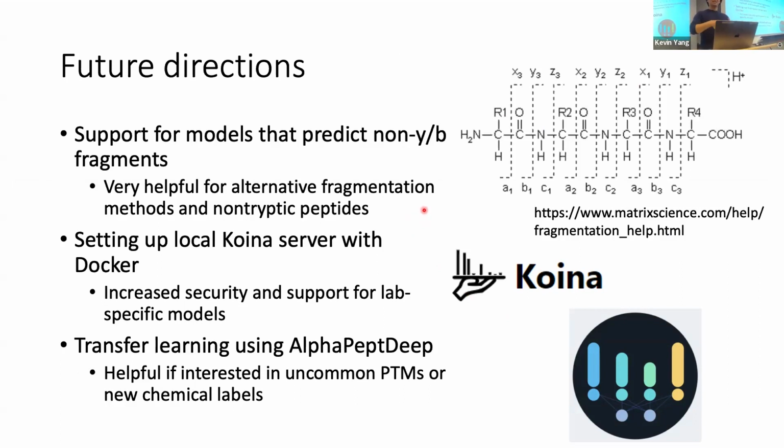But there are also different fragmentation modes that you might be interested in. Also, in the case of HLA peptides, you get a lot of internal fragments, where you get fragmentation both on the left and right-hand side. So you get these internal sequences, but those aren't predicted by current models. And so I'm going to incorporate some of those to help improve rescoring again.